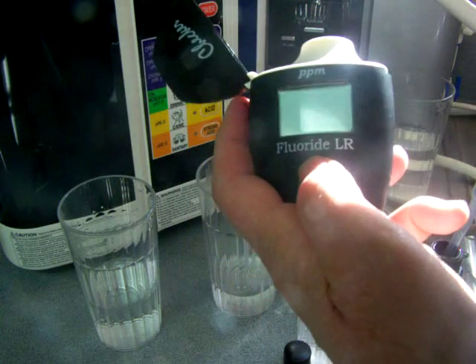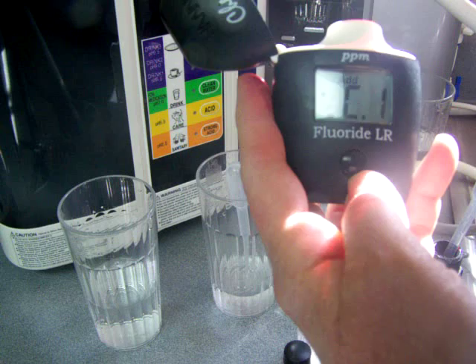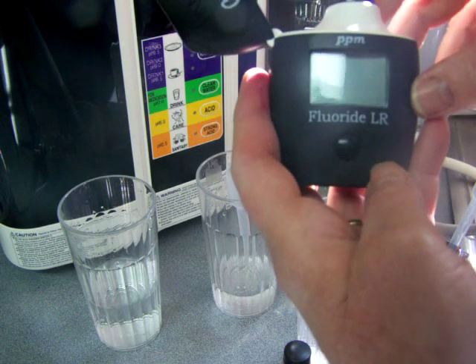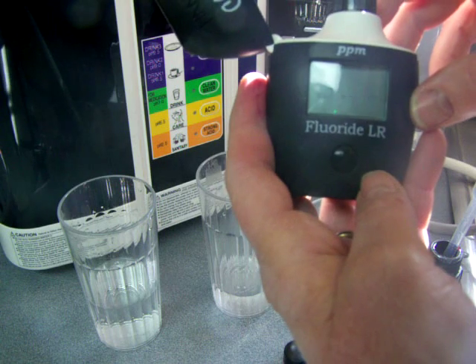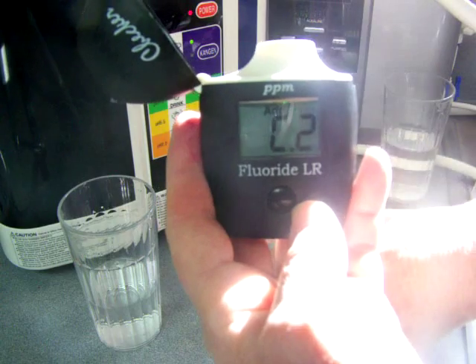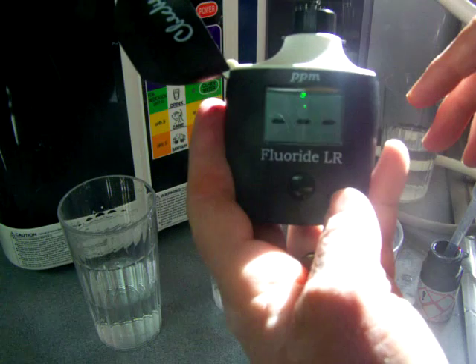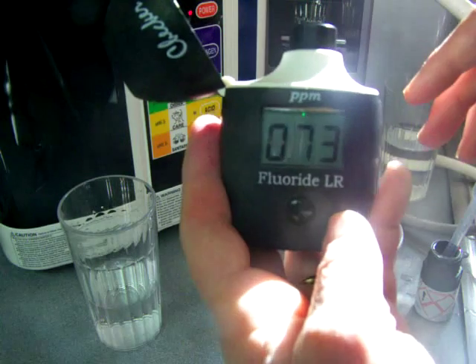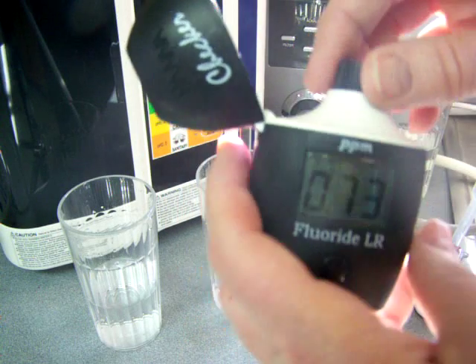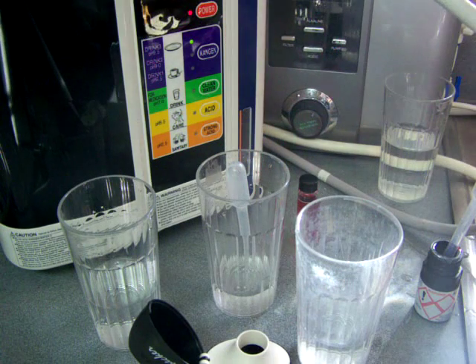Let's look at St. Louis tap water. It says add C1 — this is the control — then add C2, that's my tap water. So it's saying that my tap water has 0.73 parts per million of fluoride.